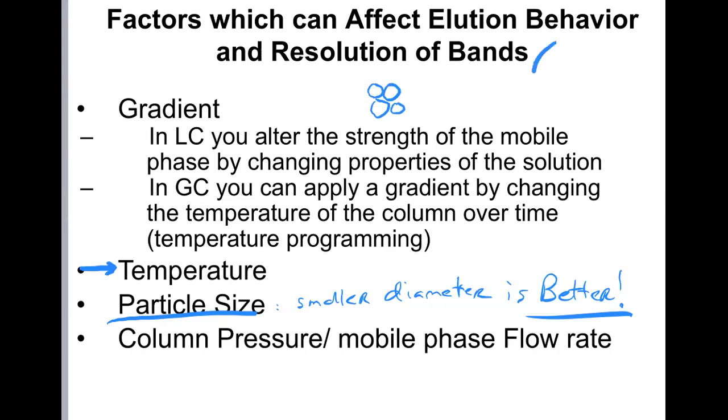Compare that to big particles, relatively speaking, okay? Should have probably not drawn that one there. Let me move that a little bit. Okay, if you make the particles small compared to big, if there is a molecule that's sort of down between these particles, I'm trying to draw it in red, right? It could be two cases.